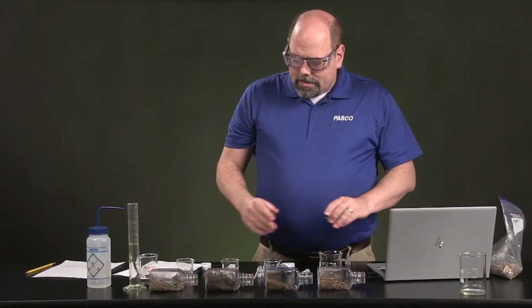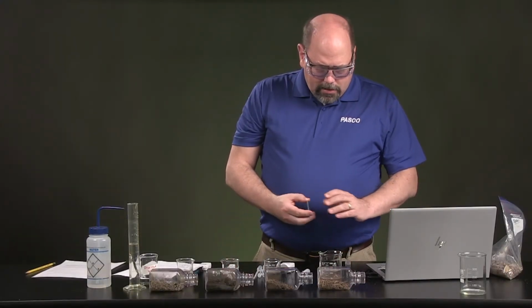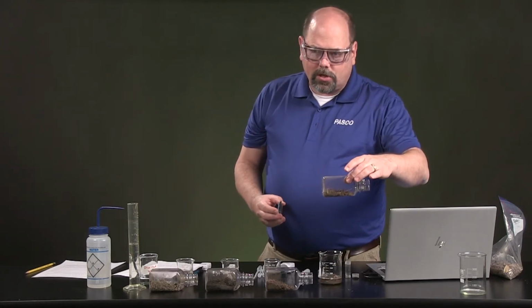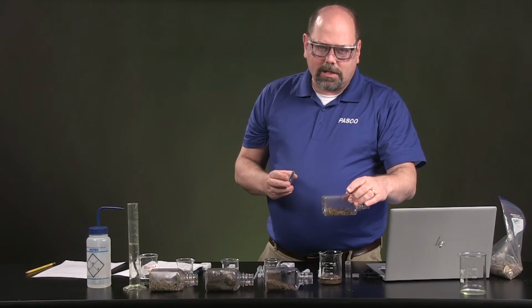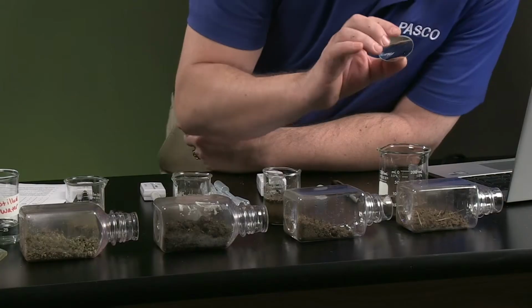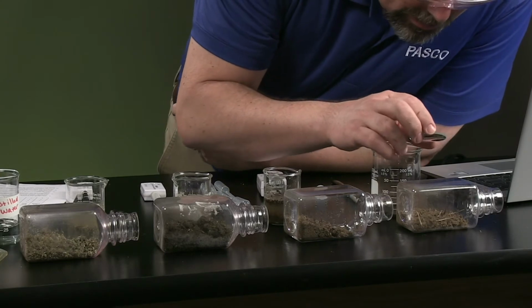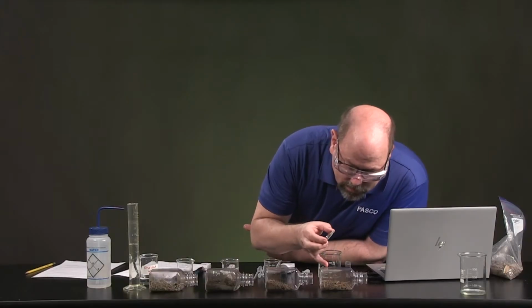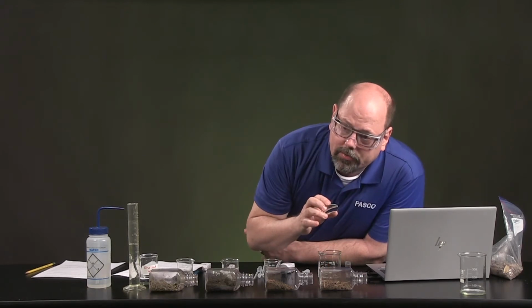We've got our samples out, and in terms of putting each sample into the bottle, before we start to measure those, we do want to make physical observations. And so if I lay these down, I can take a magnifying glass, and this is really a good level. I can take a look in there. I don't see any bugs. This is the grasslands soil that was there.